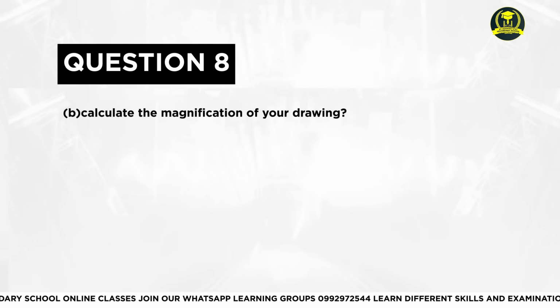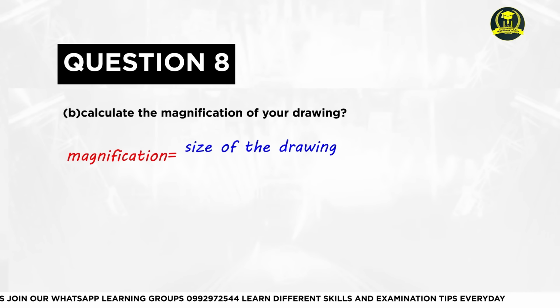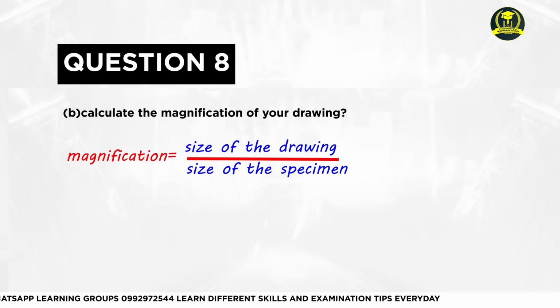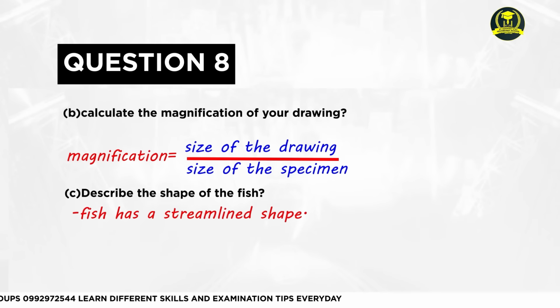Question B. Calculate the magnification of your drawing. By using the magnification formula, magnification is equal to size of the drawing divided by size of the specimen. Describe the shape of the fish. Fish has a streamlined shape.